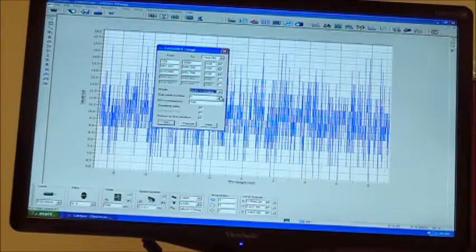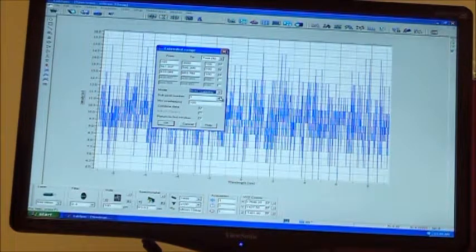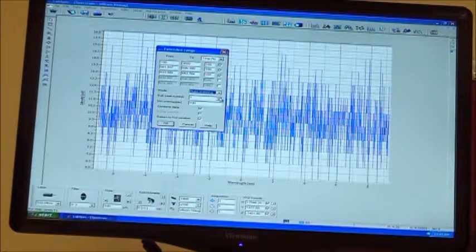Okay. Because what it'll do is, as it acquires, it'll hit all 1,000 pixels, and then it'll move 1 pixel over. So rather than hitting from pixel 1 to 1,000, now it'll hit from pixel 2 to 1,000. Then it'll move some more, and it'll hit pixel number 3 to 1,000. But all those times, it's always hitting pixel 500. So by the time you get out there, pixel 500 has seen data 500 times. So the data gets very, very good.